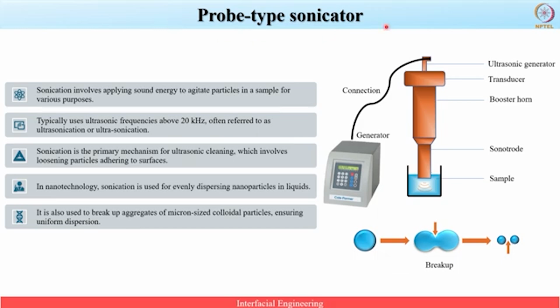As the name suggests, this device produces sonic waves using a probe attachment. This probe is directly immersed in the sample and the sound waves generate from it, and it helps to agitate and mix the sample. This is the closer look of the instrument.